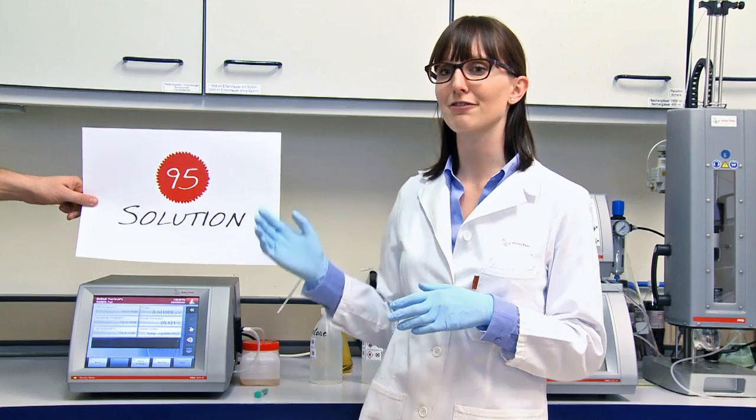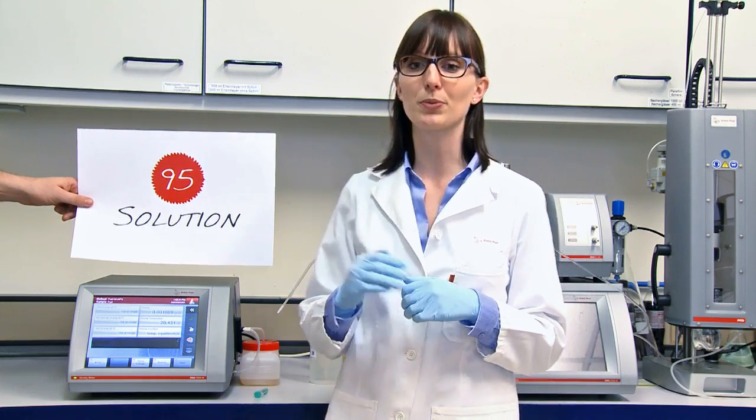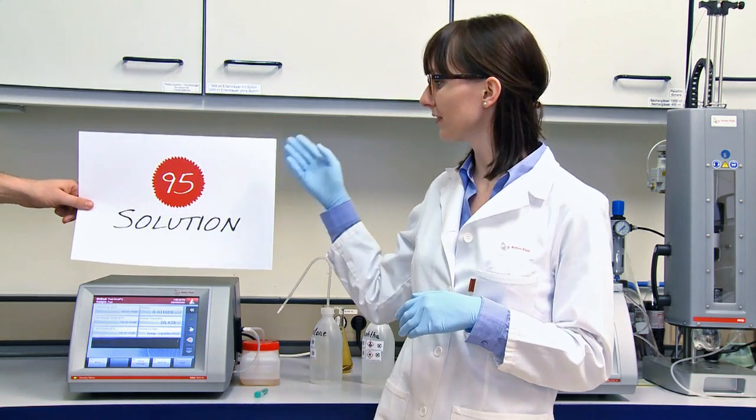This was a density measurement on fuel with DMA 5000M from Anton Parr, which is solution number 95. I think now I need to head for the captain and report the results.